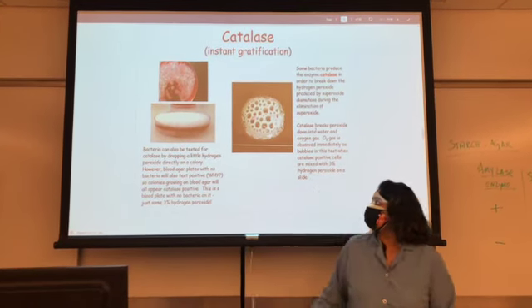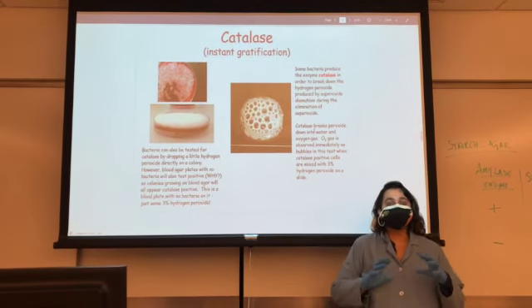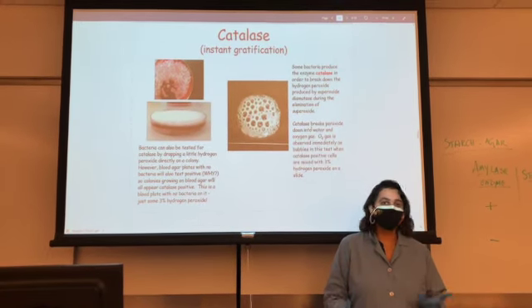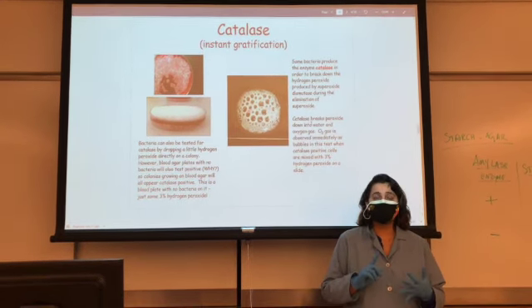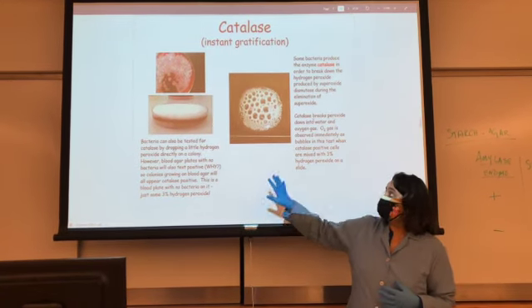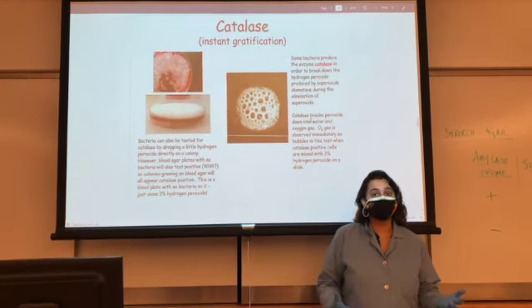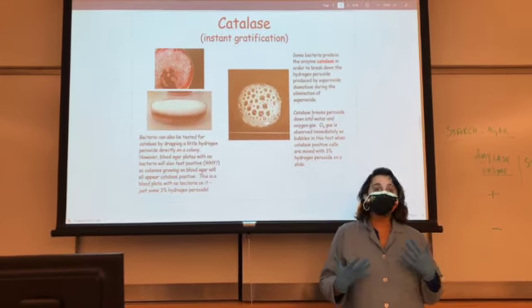So this is the last gram-positive diagnostic test we'll be learning today. You are testing whether the bacteria has catalase enzyme or not. Catalase enzyme is present in many of the aerobic bacteria. The aerobic bacteria should either have catalase or peroxidase or superoxide dismutase. Okay? So if the bacteria has catalase enzyme, the catalase would go and break down the toxic byproducts of oxygen metabolism. Okay? And one such toxic byproduct is hydrogen peroxide.